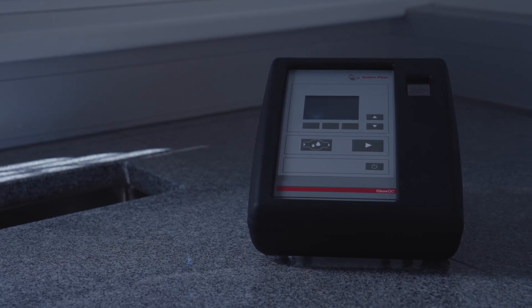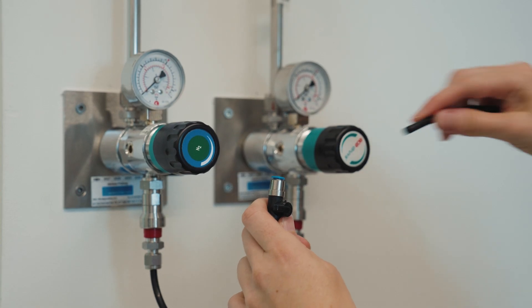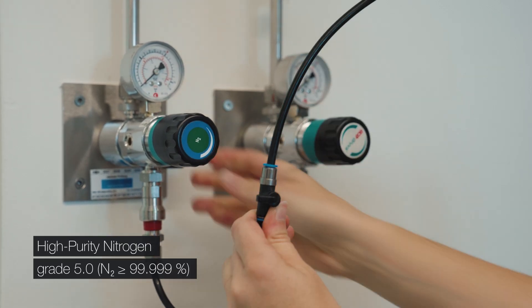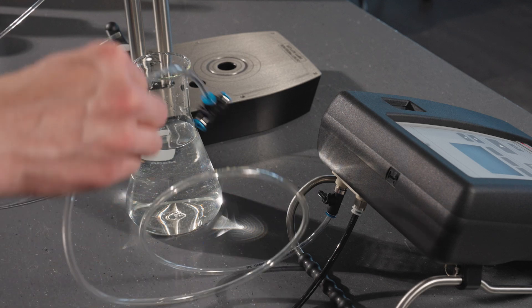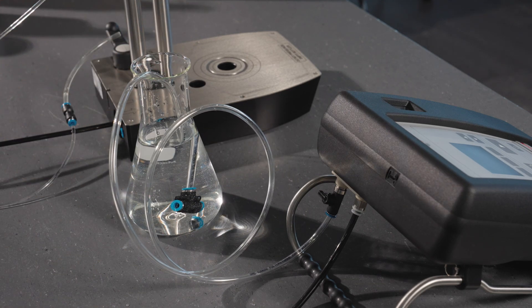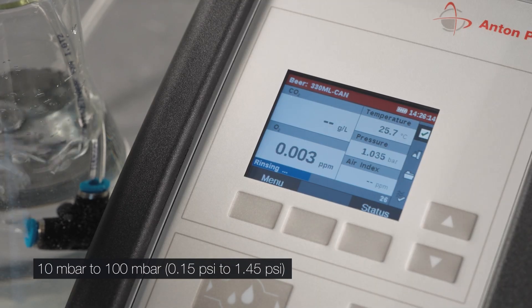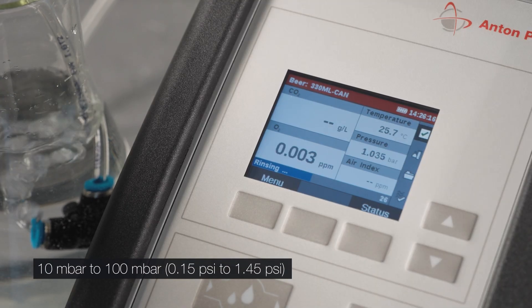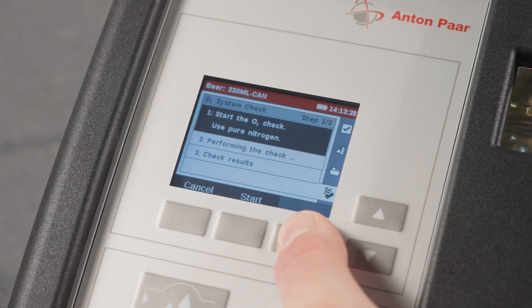Keep the instrument in the lab overnight and run the check the next morning before measurements. Connect the nitrogen supply and ensure both the gas and instrument are at the same stable temperature. Close the ball valve and place the waste hose into a water-filled vessel to check for gas flow through the instrument. Apply nitrogen overpressure and start rinsing until the O2 reaches a stable minimum, then start the O2 system check and follow the instructions on the screen.